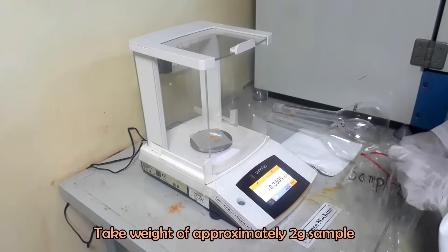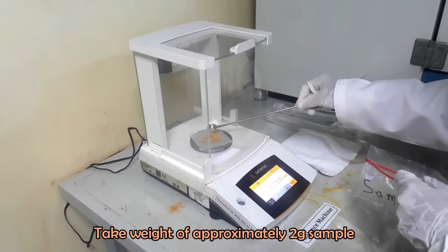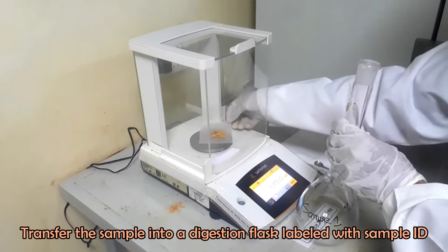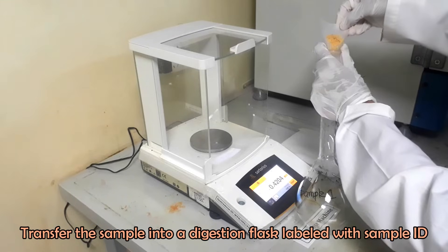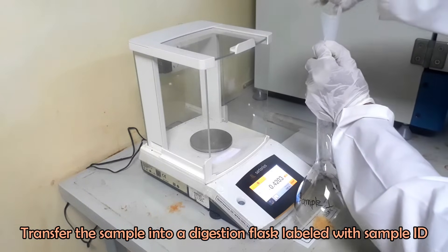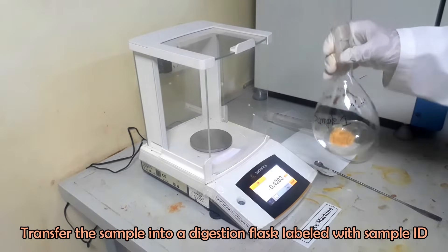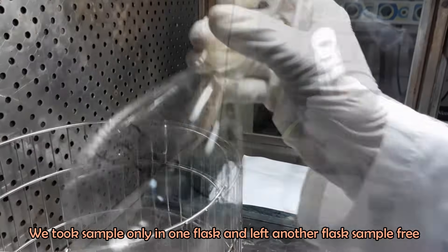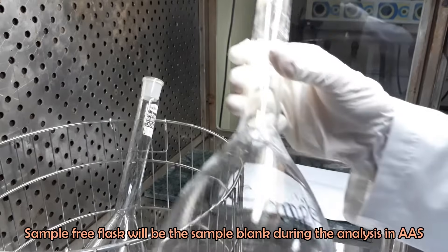Take a weight of about two grams of sample and transfer the sample into the flask labeled with sample ID. We took sample in one flask, keeping another flask left blank. The sample blank will be prepared in the blank flask following every step of sample preparation, except taking sample in it.